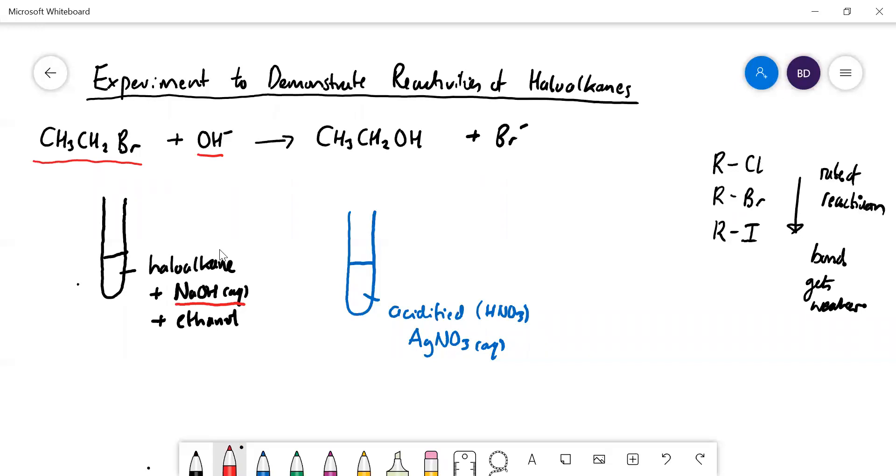We are going to form the alcohol and release a halide ion. Now how can we show what's happening in that reaction? Unfortunately, this haloalkane and the alcohol are going to look very much the same. There's no obvious physical change there.